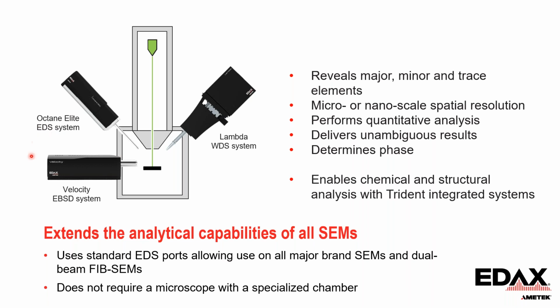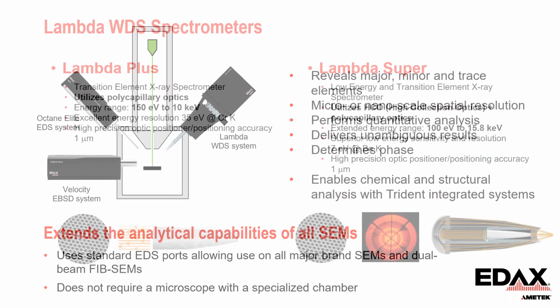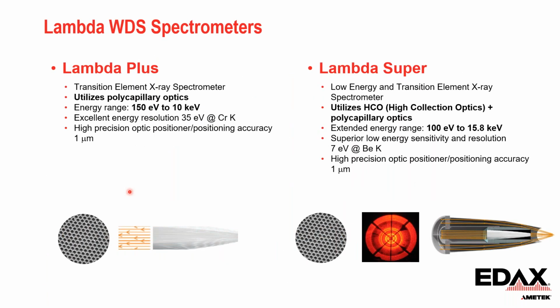You also have the option to add an EBSD system to the same SEM column to form a Trident integrated system. This enables chemical and structural analysis. So those are the two models we offer.